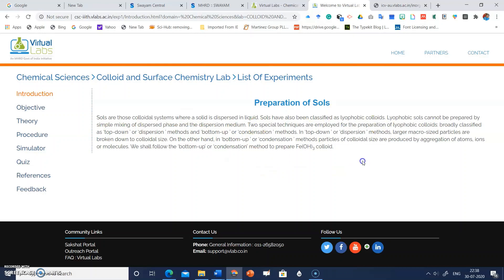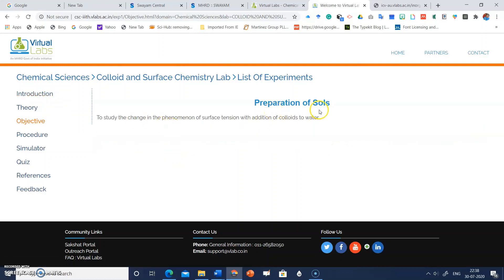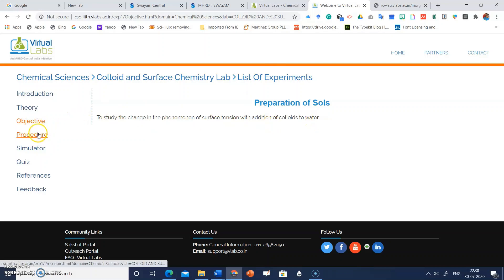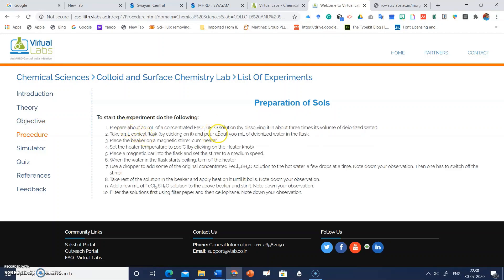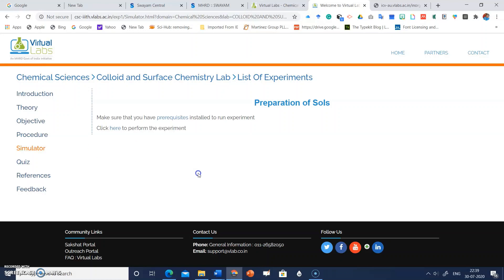Let's explore the experiment 'Preparation of Sols.' When you click on it, there is an introduction students can read on how sols are prepared. The objective is to study the change in the phenomenon of surface tension with the addition of colloids to water. When you click on 'Procedure,' the steps involved in preparation of sols are listed; students can note them down.